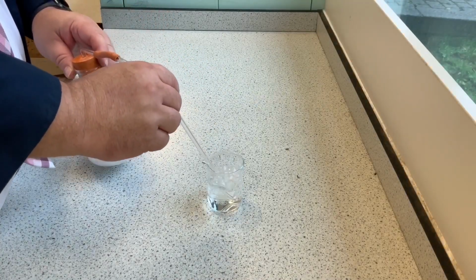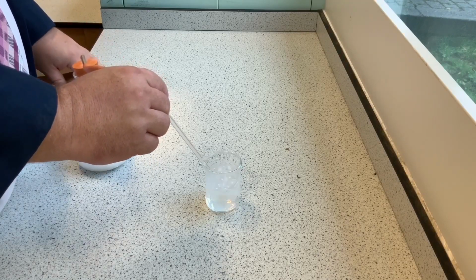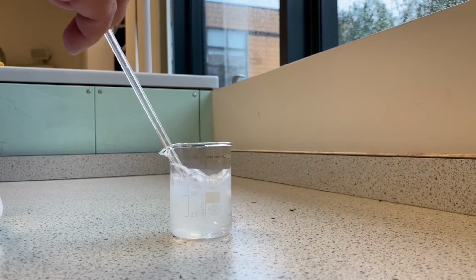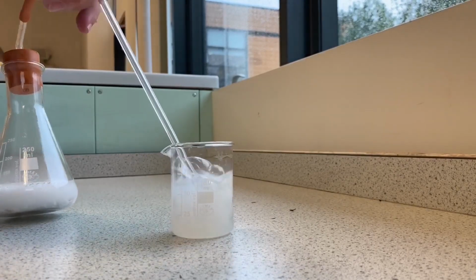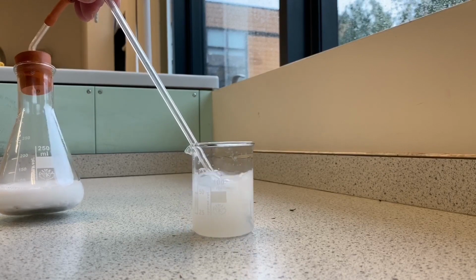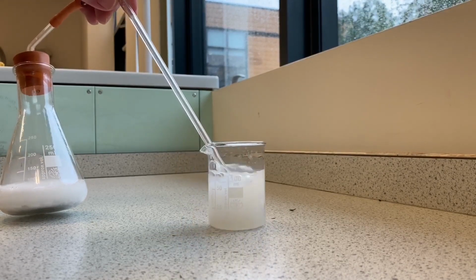I've got my little delivery tube here, and I bubble the carbon dioxide gas through the colourless lime water, and if we look carefully we should see that the lime water goes from being colourless to being milky, or cloudy we could say. It's a precipitate that forms inside which makes it go cloudy or milky.